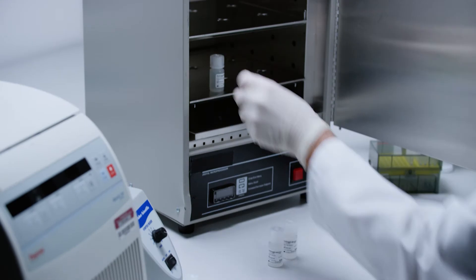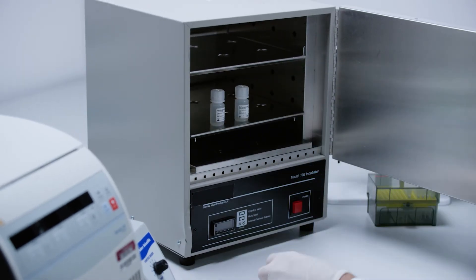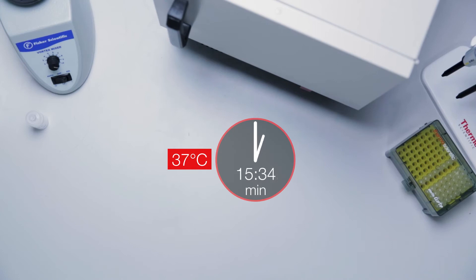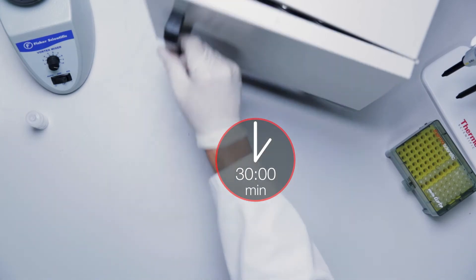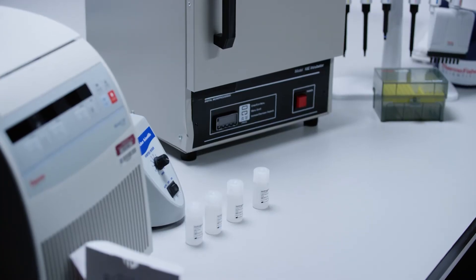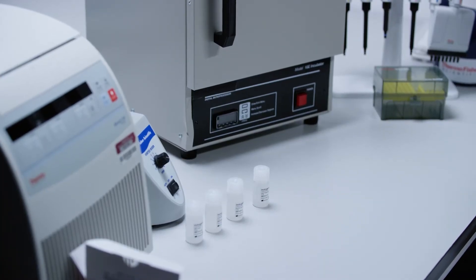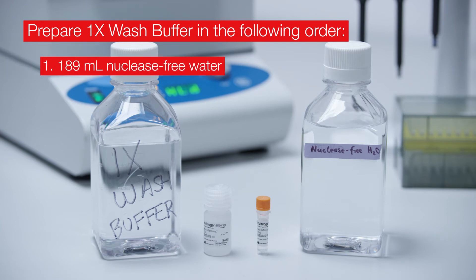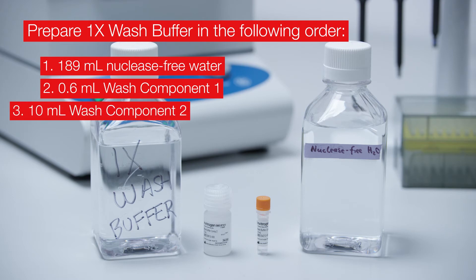Warm the pre-amplifier, amplifier, and label probe solutions at 37 degrees Celsius for 30 minutes to dissolve any precipitates. Leave at room temperature until ready to use. Prepare the wash buffer according to the protocol in the user guide using nuclease-free water and wash buffer components 1 and 2.